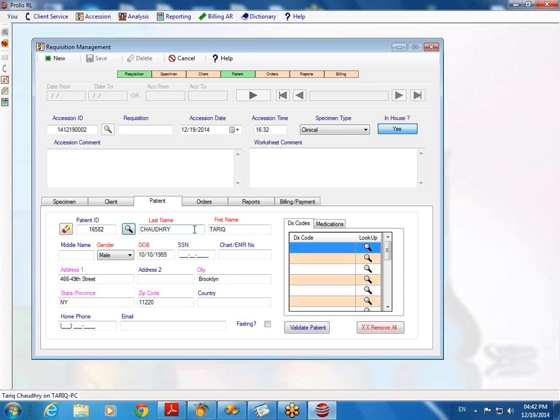So if I look at the screen in front of us right now, even if we could just add a couple of data fields to it, like a checkbox that says sample returned and date of return. Yes, you could.